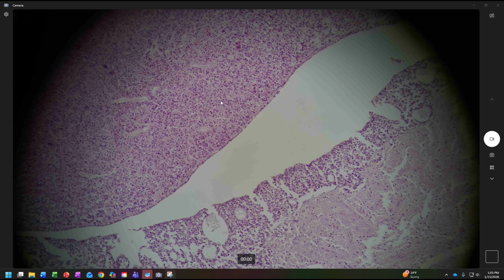The cells, and I'll show you the 400x view so you can know, yeah, these are cells packed tightly together, more dense, more nuclei. Putting those dots closer together is going to make it look darker and definitely grainy. Here, a little more wispy. And again, remember, we're looking at this part of the posterior pituitary gland, not this stuff. Again, I'm pretty convinced this is probably some sort of epithelial layer, but again, not 100% sure.